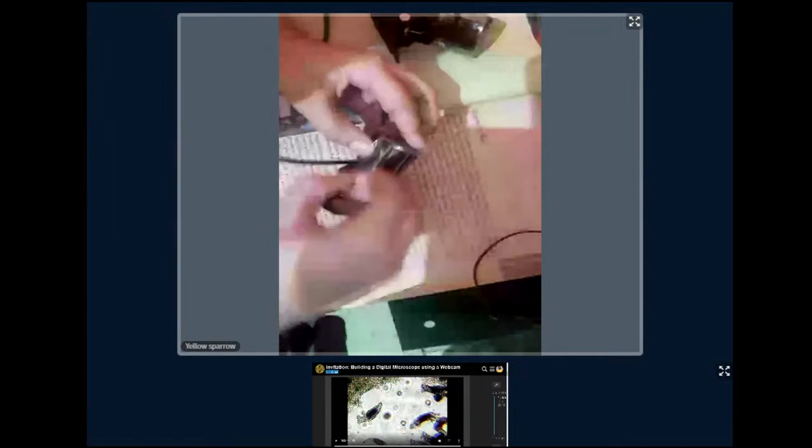And there will be one more, I think, in the bottom, near the wire. So there is a sticker there, right? There's some paper sticker there. Yes. If you remove that paper sticker, you will find one more screw behind it. Yes, sir. So using the screwdriver, you take these two screws out. These are the most important ones that we need today. That's enough. Now you can see the screw. Yes. Now take the screwdriver and open it up.